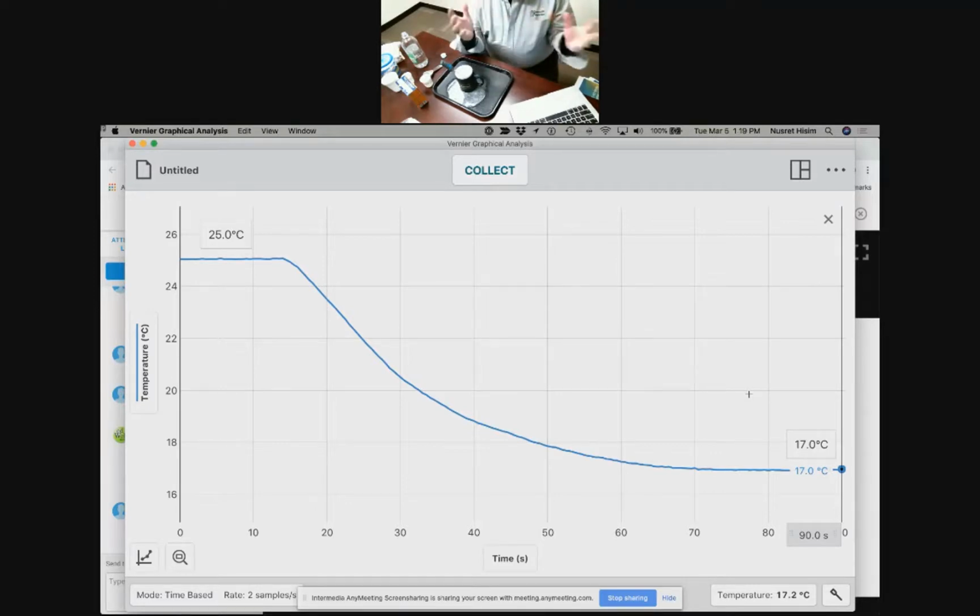So you can see that by doing it this way, the students get some experience with reading a graph, getting the data from the graph, and then applying a simple mathematical application to analyzing the data. Now, the thing to think about is, is this the only thing that's possible? Well, of course not. There are lots of different chemicals that might be available to you in your classroom or in the house. We'll talk a little bit about safety after we do the next one.